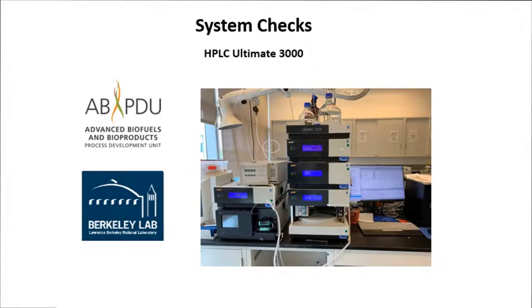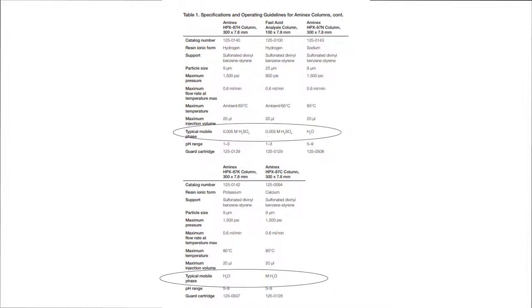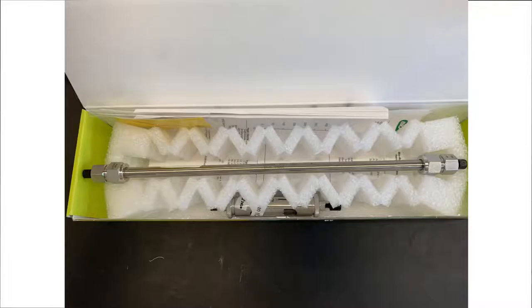Before we start the operation, we must first check that all units are in working order. First, check that the correct column is installed to run the analysis. Do not use a column outside of the pH range identified by the manufacturer. Confirm the column is compatible with the mobile phase being used. For new columns, pump at least 5 to 10 column volumes of mobile phase before connecting the column to the detector. Use a dedicated column for each application to ensure it is not contaminated with non-volatile salts or eluents.